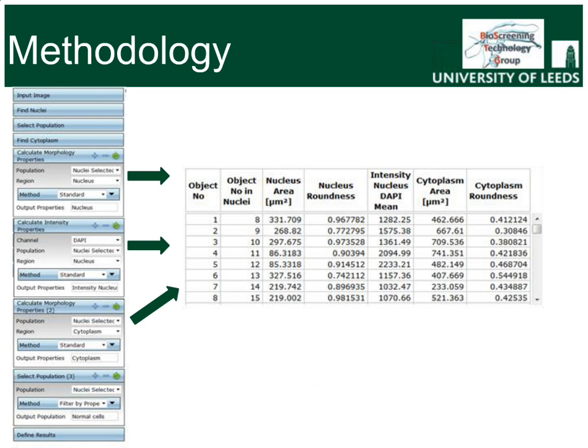Taxol and doxorubicin were selected as potential positive controls, whilst not being true cytotoxicants, they are well documented to have multiple cellular effects, including inhibition of cell cycle and induction of apoptosis. And by not using pure cytotoxicants, the assay's ability to detect subtle and pre-lethal changes in cell morphology may be enhanced. Also, these compounds are natural-like products and thus mimic the contents of the test library.